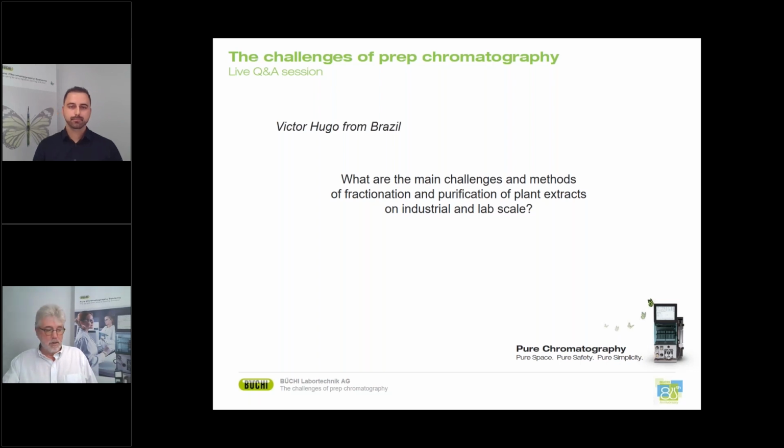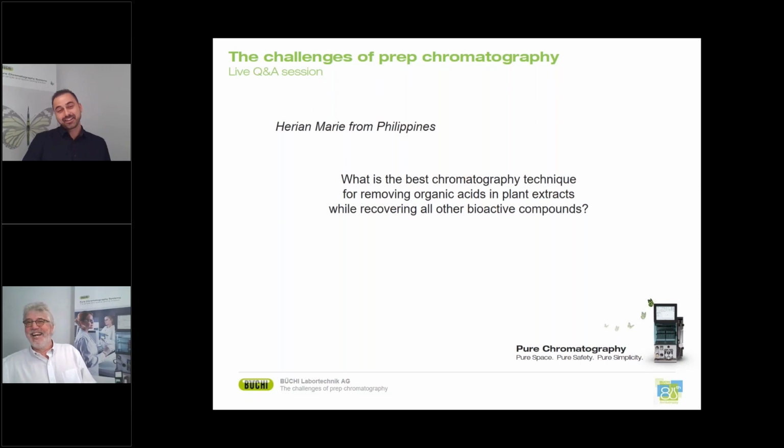I agree. And I think we hit quite a spot here. We getting plant extract questions here. Okay. The next one is from the Philippines. What is the best chromatography technique for removing organic acids in plant extracts while recovering all other bioactive compounds? I like that one. Well, usually the ones you like are the most difficult to answer. Of course.